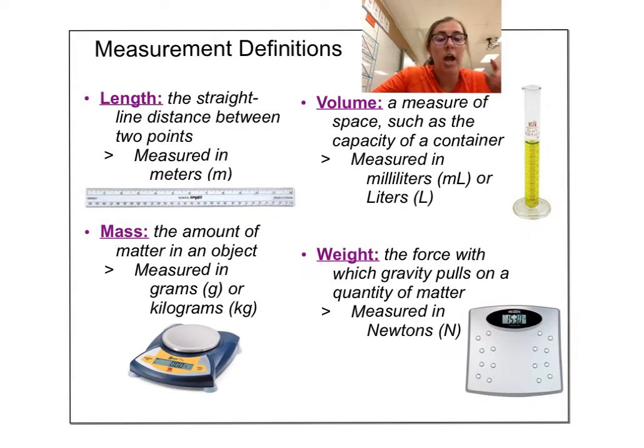Okay, first of all, I understand this is high school and you are a smart person, but you would be shocked when I say, hey, go get the mass of this, and a kid tries to put it in a graduated cylinder like this, right? Or if I say, hey, go measure the volume, and a kid puts it on the balance. Okay, so again, I understand you're an intelligent human being and you know what length and volume are, but I've seen it before from kids your age, so I just want to make sure we're all on the same page so you don't look a fool in the lab, okay?